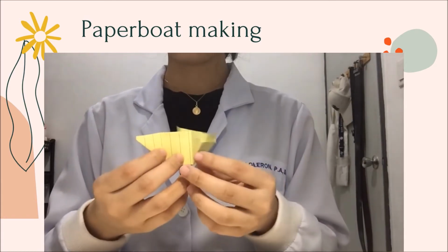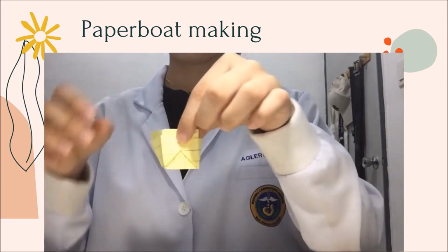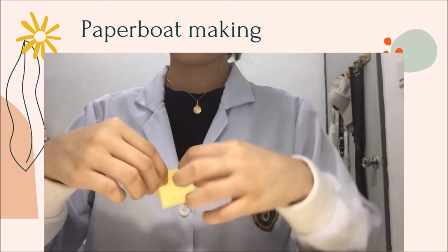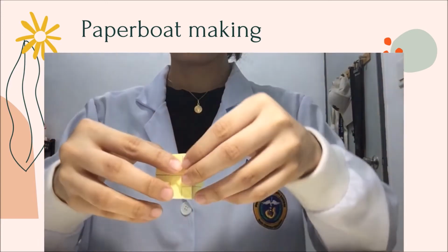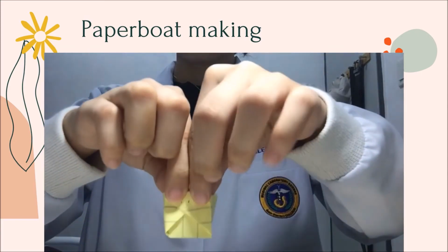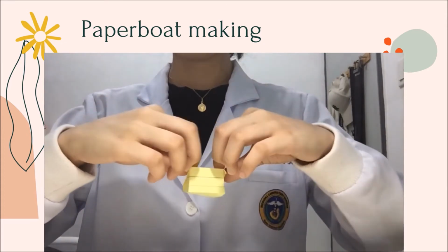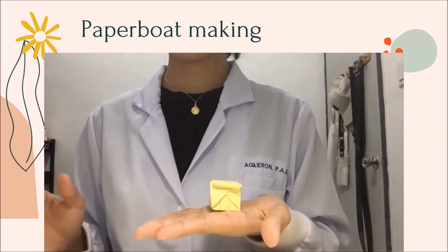Now let's fold these 2 flaps on the same side towards each other. And repeat it on the other side. Fold them towards each other. Lastly, let us fold these 2 newly created flaps to stabilize our paper boat. And finally, our paper boat or disposable boat is now ready for the embedding medium.